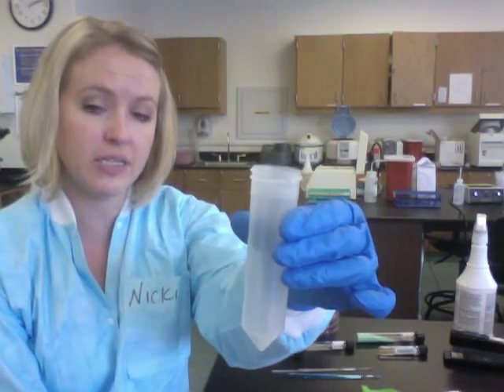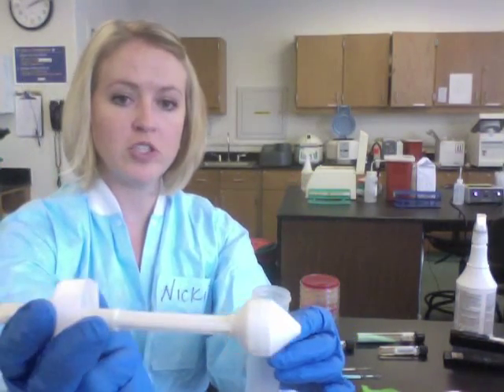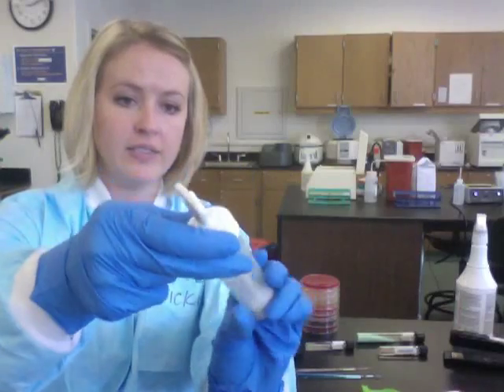Now if it's a large tissue, you will need to cut it with a scalpel. Put it in here, then take the grinder — which looks like this — and place it into the conical tube and secure the lid.